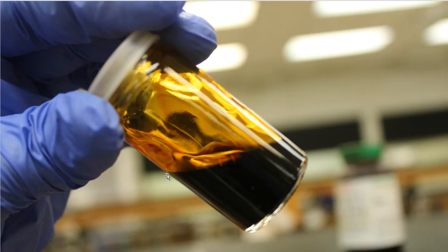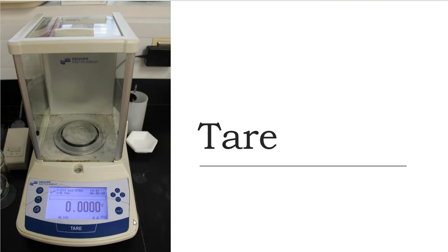This is my THF solution with the iodine. So again, you can make your observations with the iodine solution that you need for maybe a lab notebook. All right, so then I'm going to go back to my balance. I'm going to tare it out again one more time. It seems like this is a very common technique that we need to use in a laboratory, doesn't it?